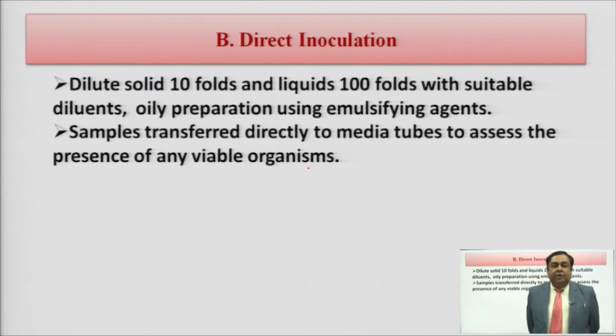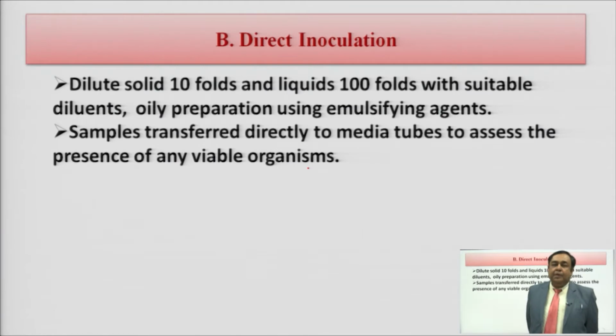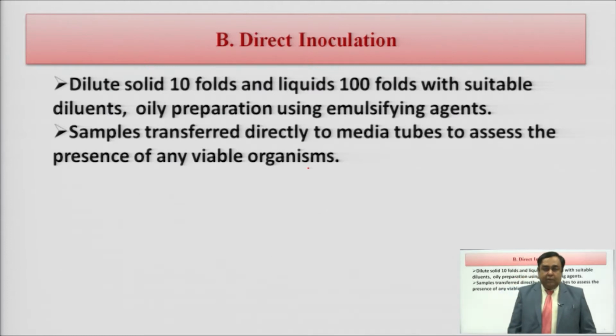In membrane filtration, we have to convert a solid into a flowable form, and then carry out the process of membrane filtration.